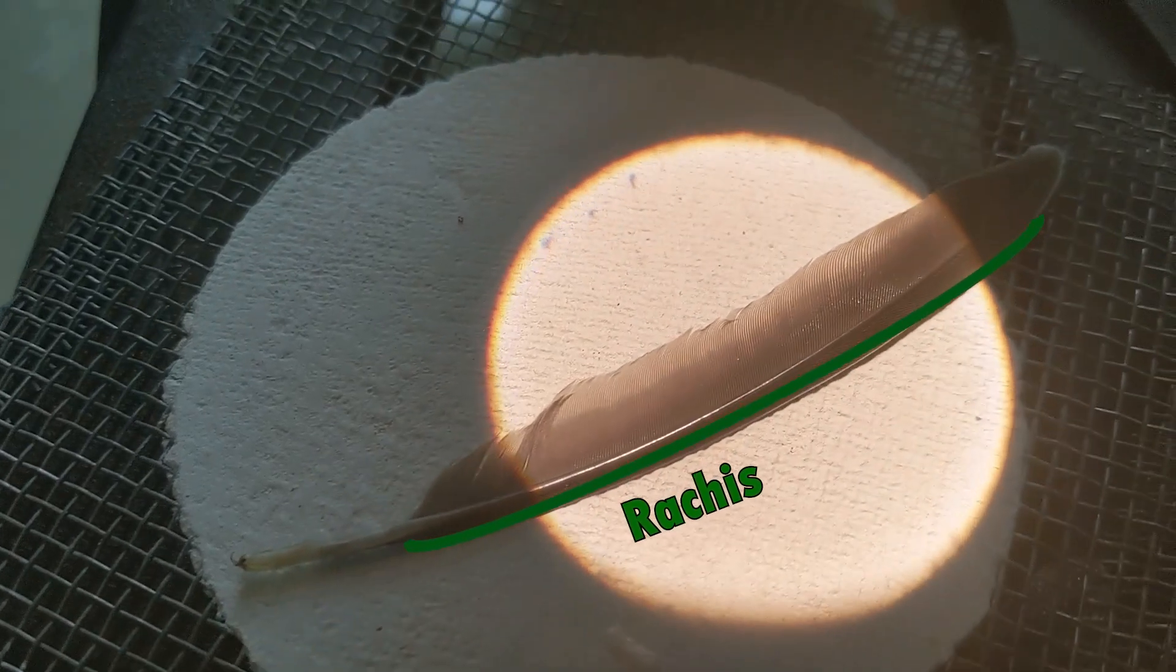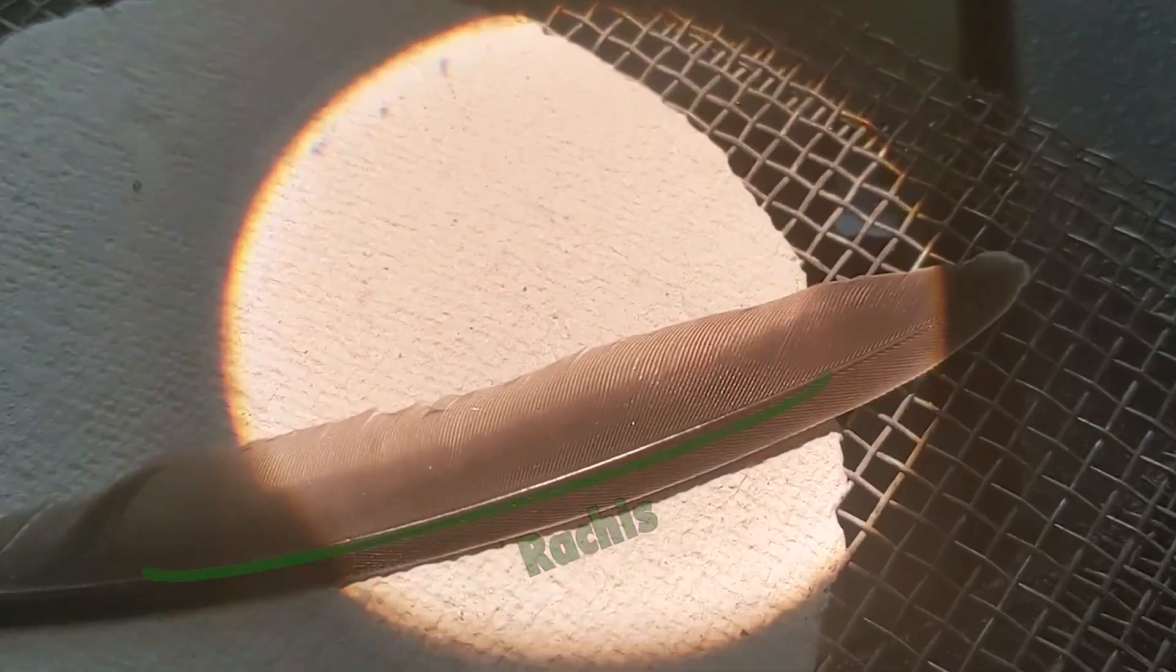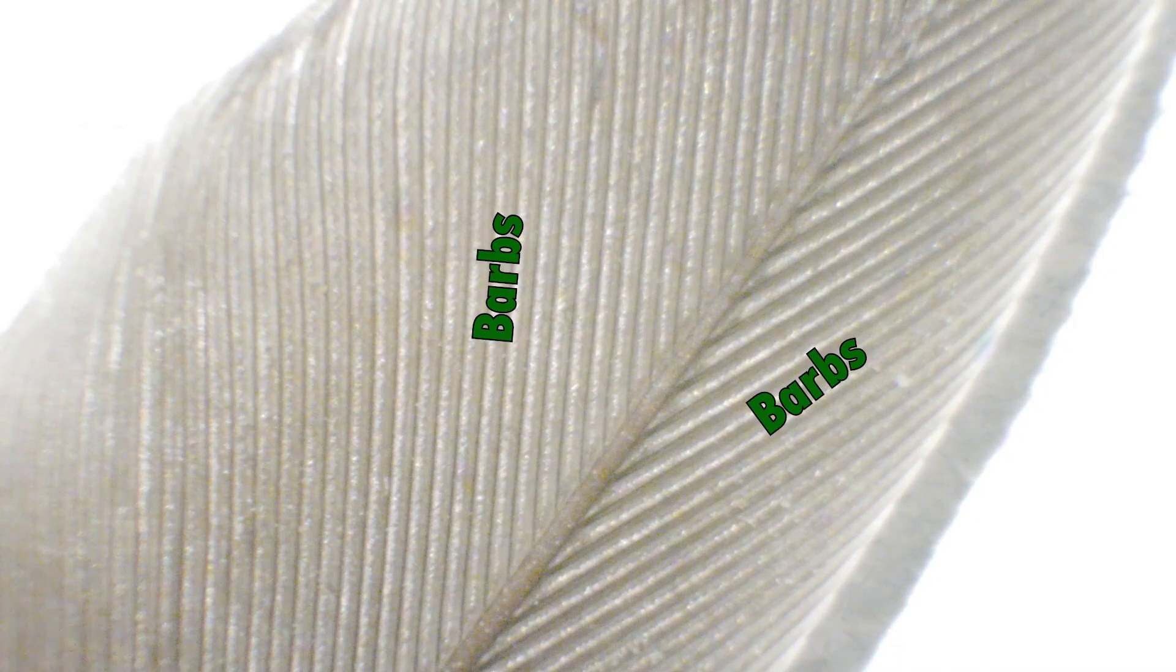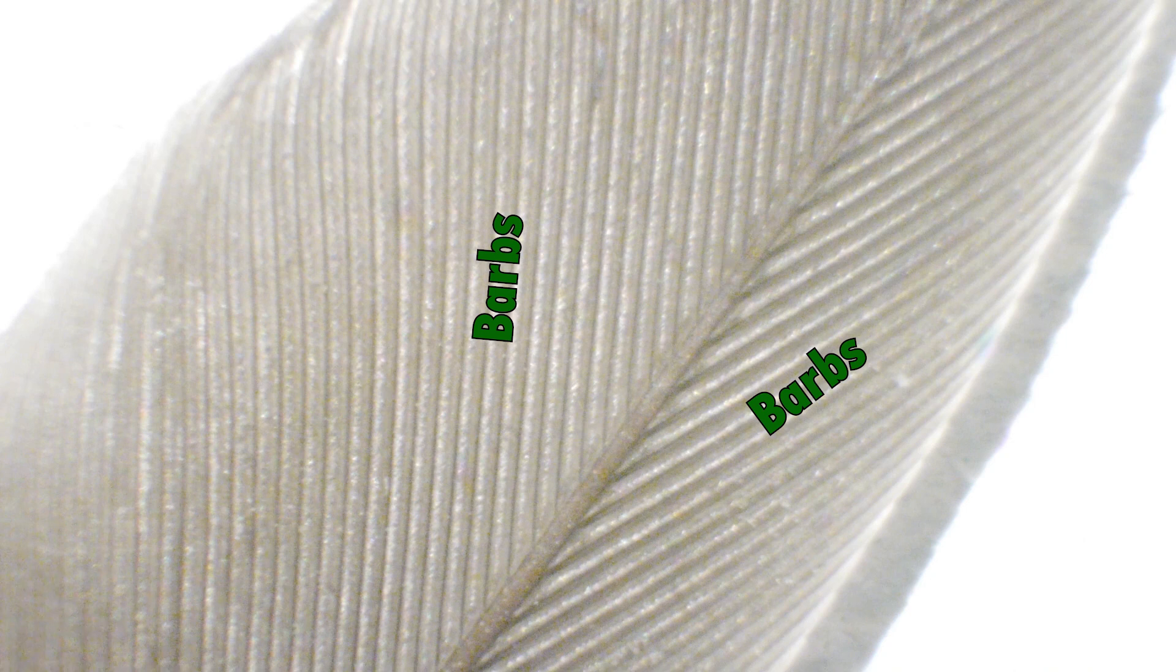That shaft through the middle is called a rachis. Now you can think of the rachis as the trunk of a tree, and there are branches coming off the rachis, like there are big branches coming off a tree, and these are called barbs. You can even see them without a microscope. If you drew a feather you'd probably draw the rachis and then the barbs.